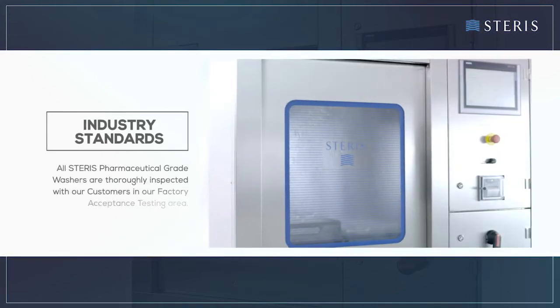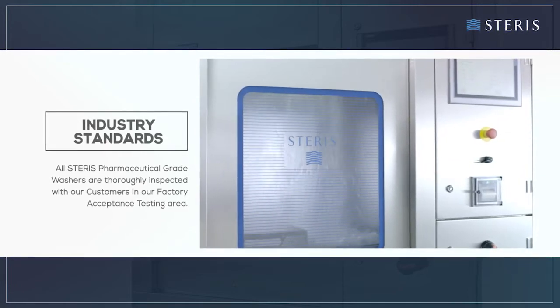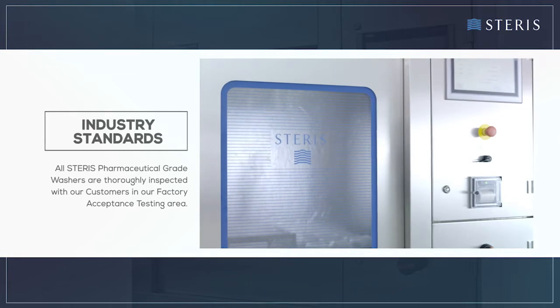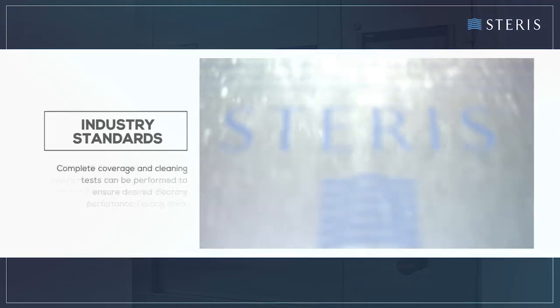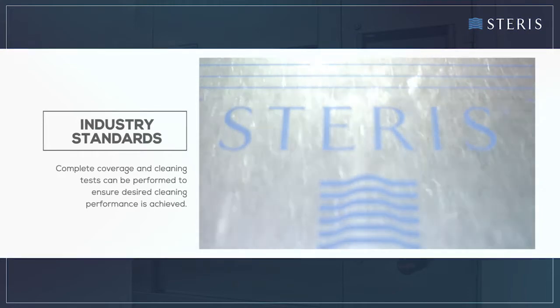All Steris pharmaceutical grade washers are thoroughly inspected with our customers in our factory acceptance testing area. Complete coverage and cleaning tests can be performed to ensure desired cleaning performance is achieved.